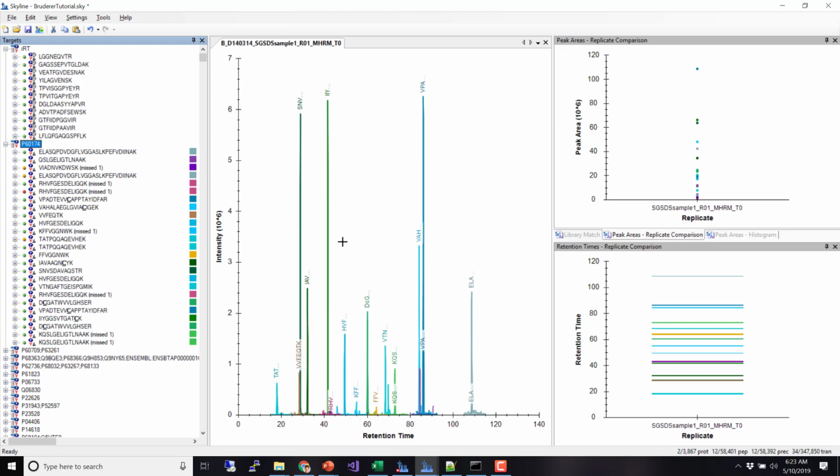Because if you collect this again and again, you'll see this same fingerprint. And when something changes in here, you can get a sense of, maybe what Mike was talking about: wow, I always see this peptide right here, and it disappeared. What was that? So sometimes things change within a protein, and that can be especially surprising.